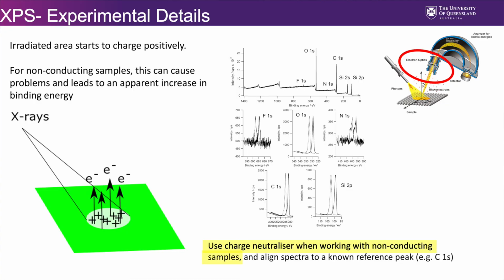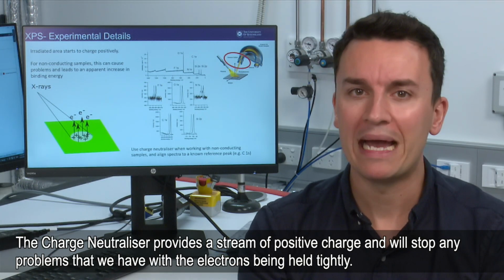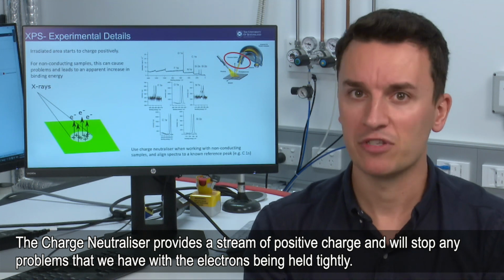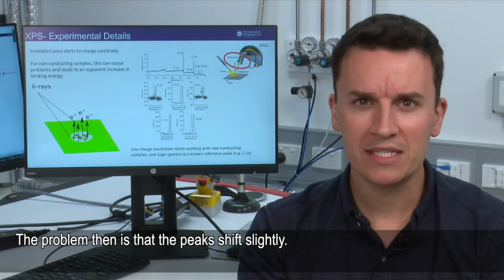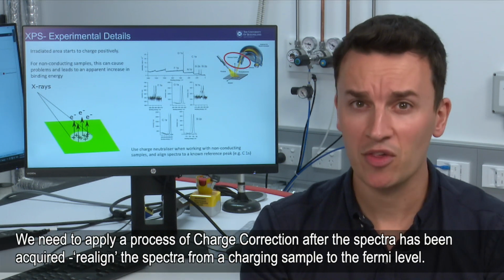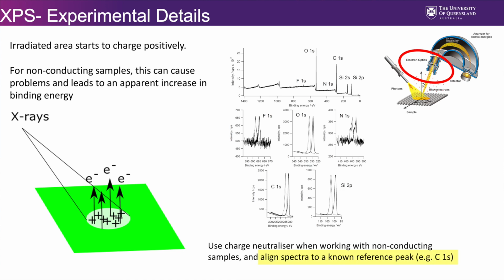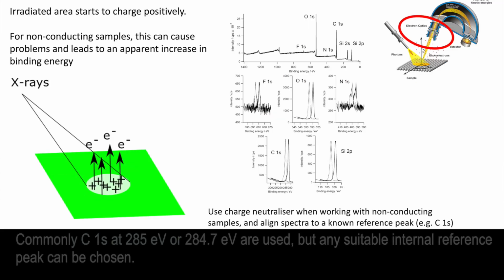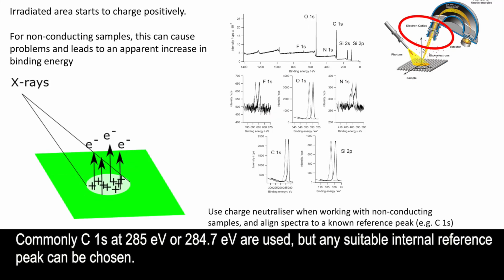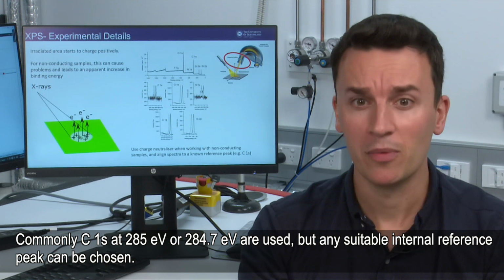The charge neutralizer will give a stream of charge, and it will stop any problems that we have with the electrons being held tightly. The problem then is that the peaks are all shifted slightly. We need to apply a process of charge correction when we come to analyse the spectrum. What we do is align the spectra to a known reference value, so carbon 1s at 285 or 284.7, depending on the type of carbon 1s, is the typical value that we would use.